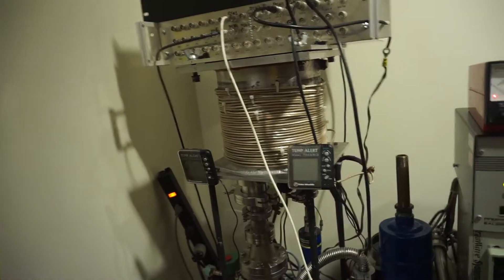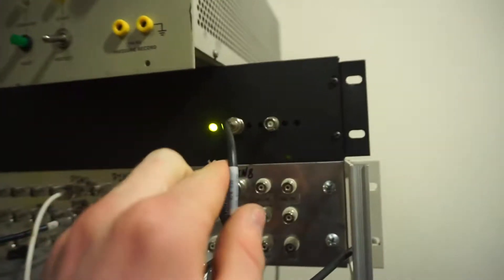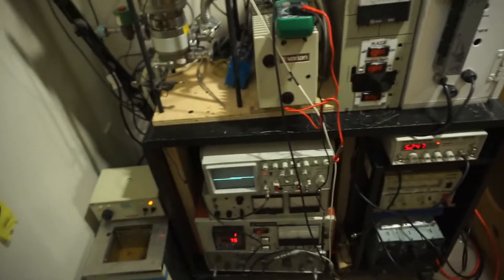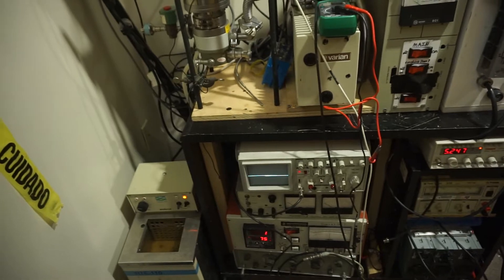So then the signal is detected on the Faraday Cup. It goes through my home-built amplifier. The signal from the amplifier goes down onto the scope, where we can read out the signal on the scope.